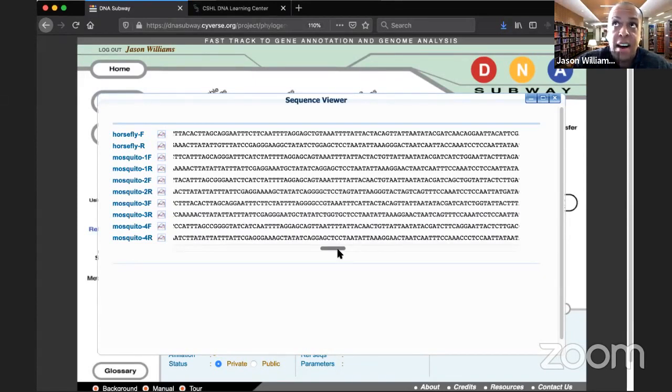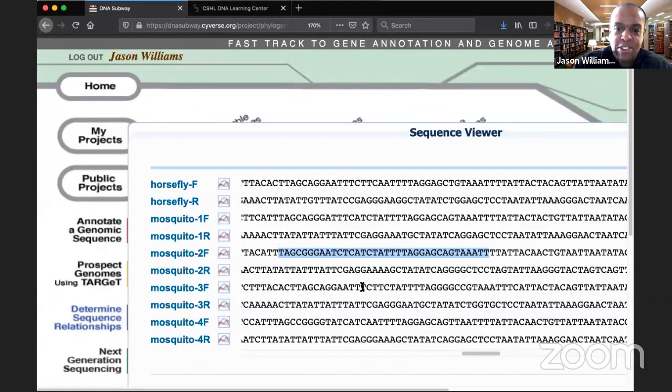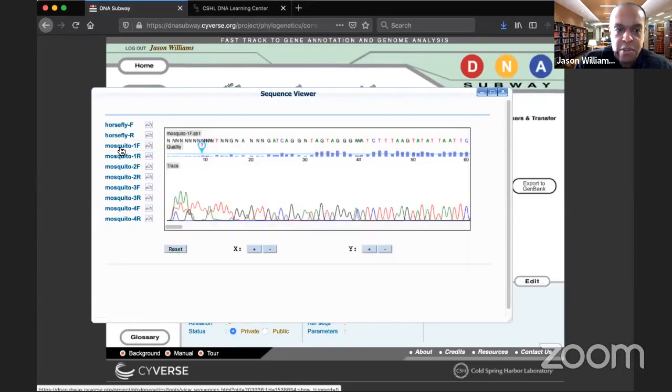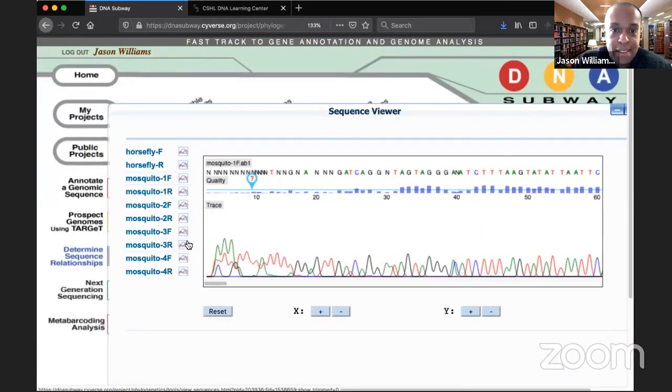And in fact, the other thing that is important for thinking about raw data is that if I just gave you this DNA sequence, and you looked at it, and I'm just zooming in with my computer here, these A's, C's, T's, and G's all look the same, right? But what you really want to think about, and the message from last week about sequence quality, is that if you click on an individual sequence, you actually get this electropherogram or chromatogram. Sorry that it has two names. I don't know which one I prefer. I think I prefer chromatograms. So I'll try to stick with that.